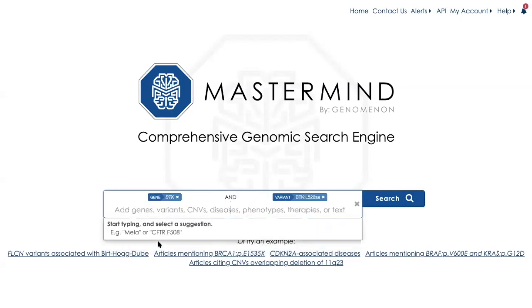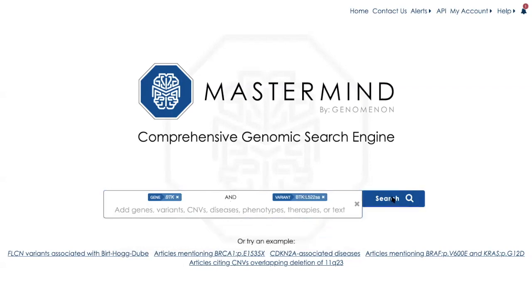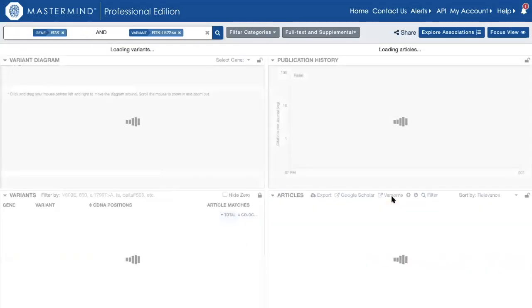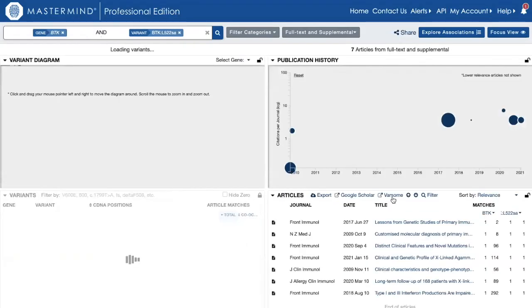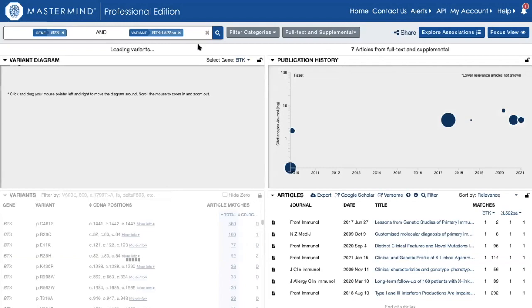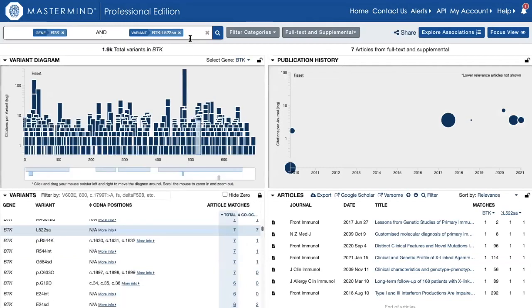I'm going to select this, and now I'm going to see the output with seven articles matching this normalized Mastermind nomenclature.